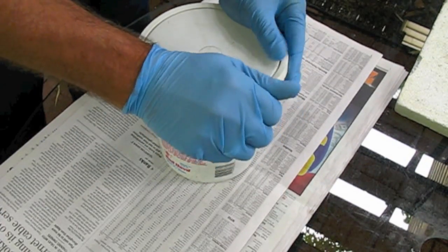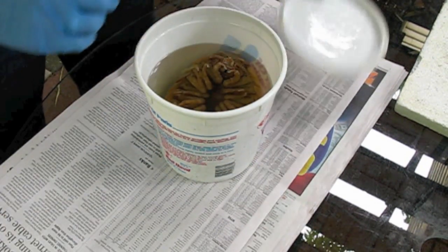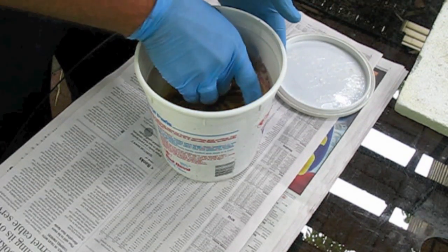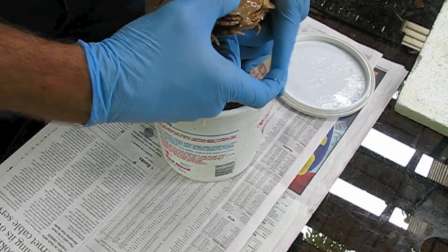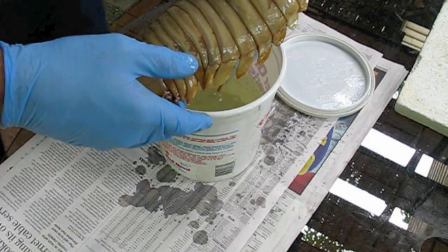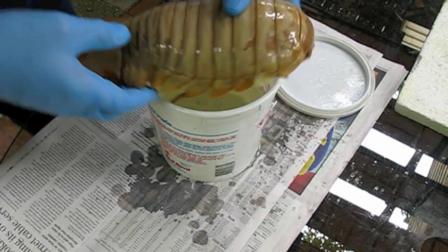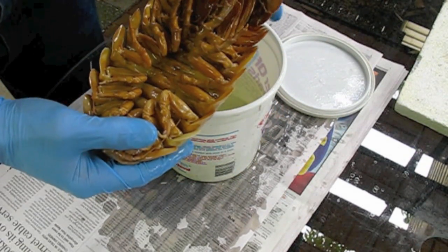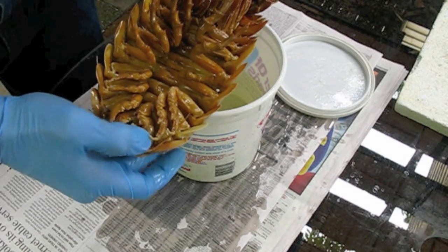This is a specimen of the deep-sea isopod, Bathynomus giganteus. It was originally preserved in formalin, and I've been soaking it in alcohol to remove the formalin, since that's kind of nasty stuff.